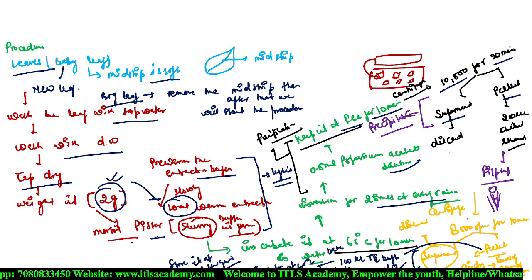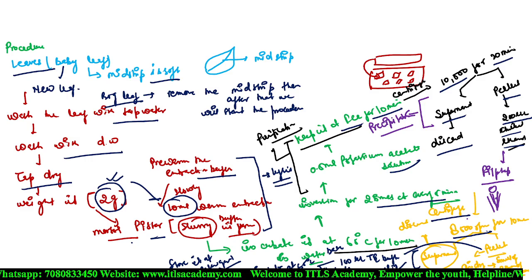We discard the supernatant, and to the pellet we add 200 microliters of chilled ethanol. Then the DNA will stick to the wall of the Eppendorf tube, so for this purpose we do a flick tap so that the DNA will mix into the solution. Clear? Yes, ma'am. Then again we centrifuge at 8,000 RPM for 10 minutes and we get what?